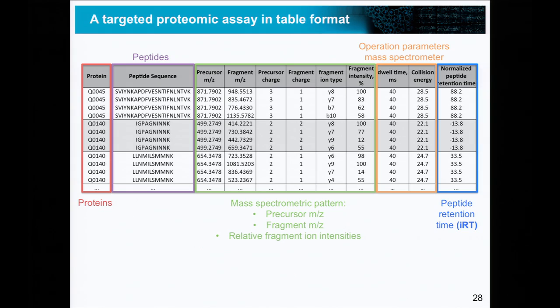We call this also the iRT retention time. And that's a retention time that is unit-free and that you can use to share your retention time information. And Arjo will explain to you how this works in detail.